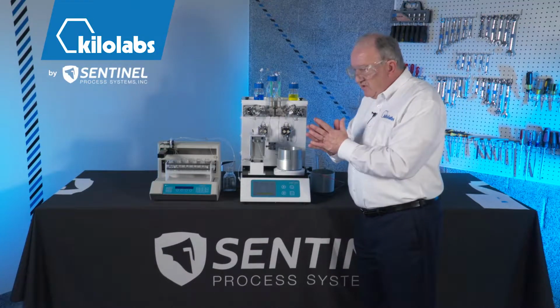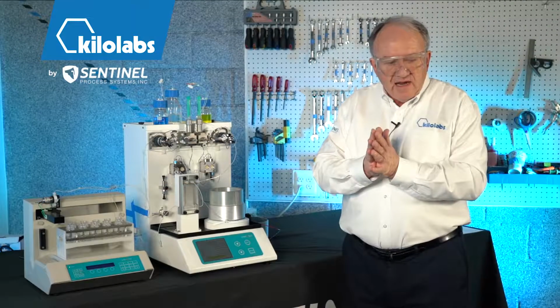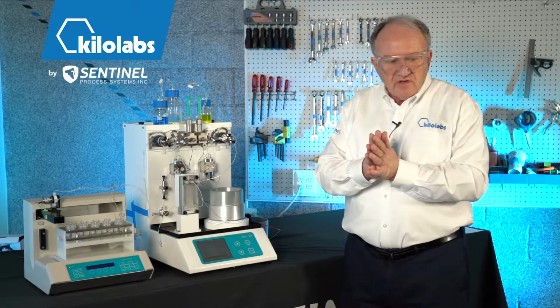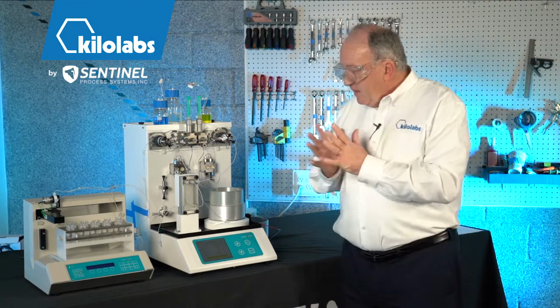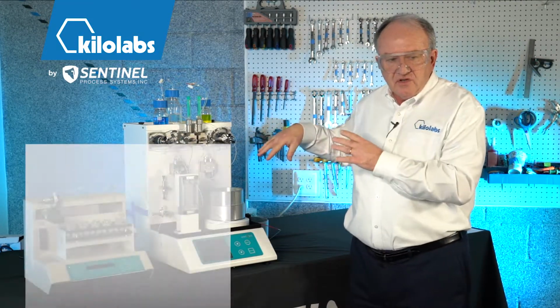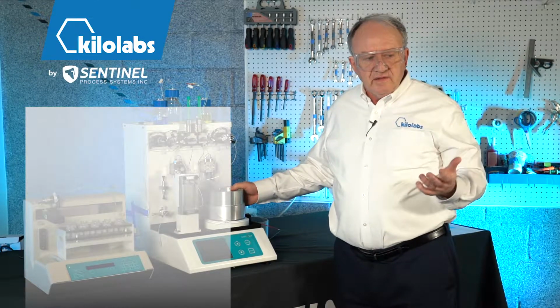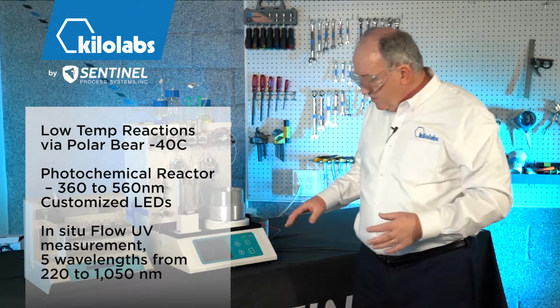The major attributes that can be set with this are the residence time inside the reactor, the volume ratio of reagents, the amount of volume of reagents that you use per reaction, plus the ratios of each, and also the temperature. And all those can be pre-programmed. And I'm going to go through with you how we get to that point. The other aspects of this is that there are other peripherals that go along with this system that I'm not going to show you today: additional mandrel coils, refrigeration coils, a photochemistry reactor, and also one that measures UV under flow conditions. But the purpose of today is to actually show you the demonstration.